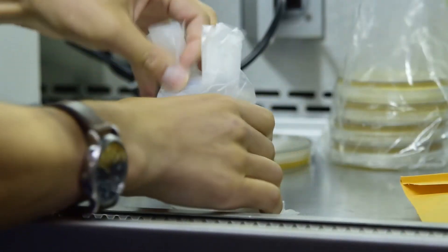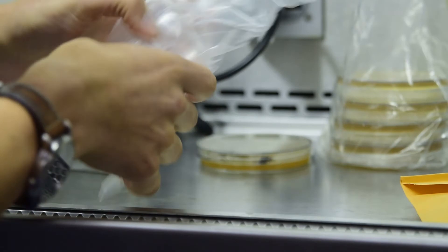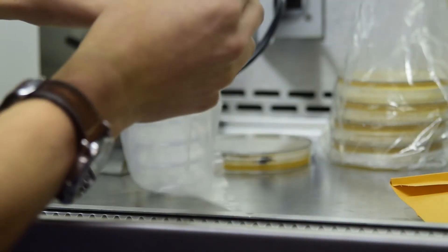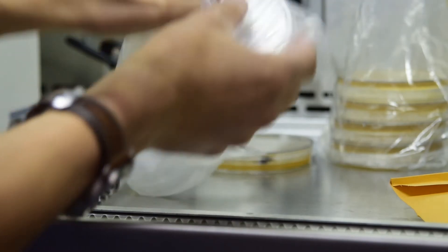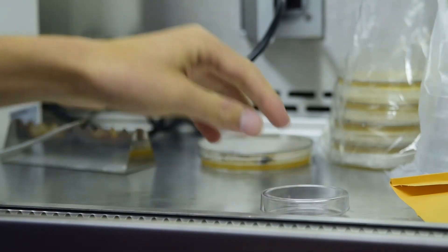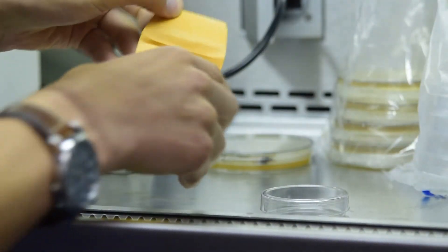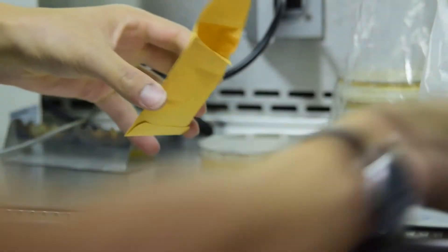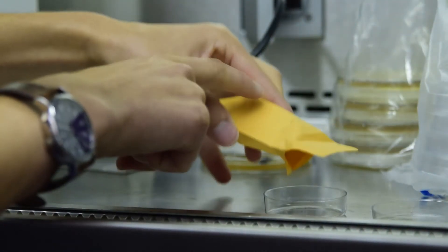Next, we will do a chitin baiting plate using an empty 60mm dish. Add dry soil to the plate, approximately one gram or more.